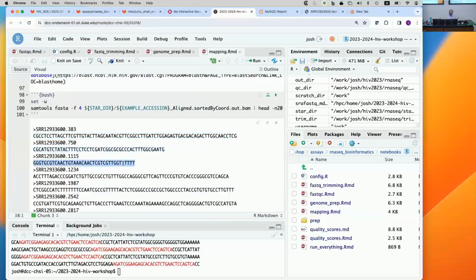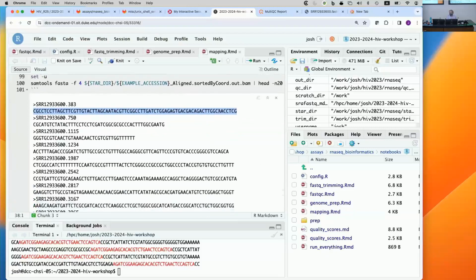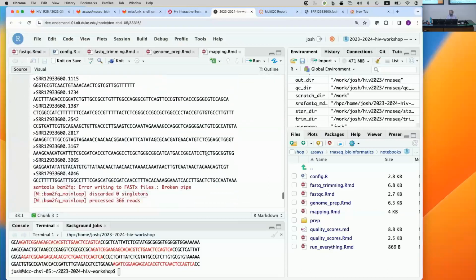If there was a tiny bit of bacterial contamination at some point in the processing, you might get a little bit of data. You can get skin fragments from whoever made the libraries. But like I said, I'll usually just take these and blast them. I'm not going to do it right now.